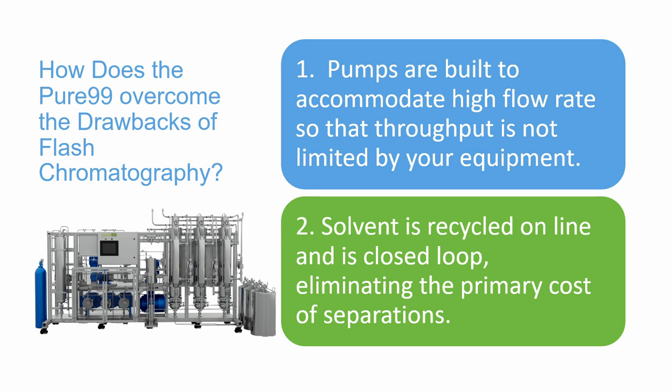It's crazy. Normally, you would fill up a room this size. I mean, we have a pretty big room here. You'd fill up a tanker car. At 7 liters a minute, you'd probably have a tanker car filled up by the end of the day. And so we're actually separating all that online, and then we're using density controls and flow rate controls, and you really only use a 5 gallon bucket.